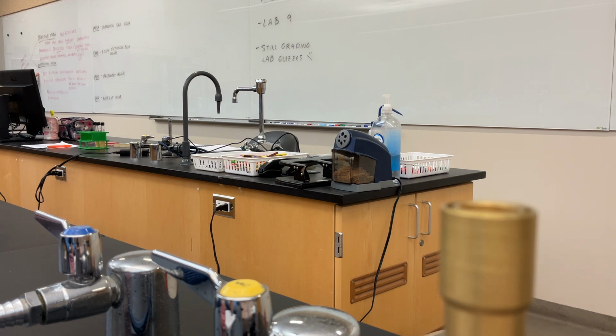All I'm having to do is put a sample on a plate, and then I come back and read my results tomorrow. After 24 hours, I can tell what I have. The beauty of this also is if I do a good job, I may even be able to not have to do a gram stain right away. Because if I'm growing something that can only be Staphylococcus, what reaction does Staphylococcus have on the gram stain? Gram positive.